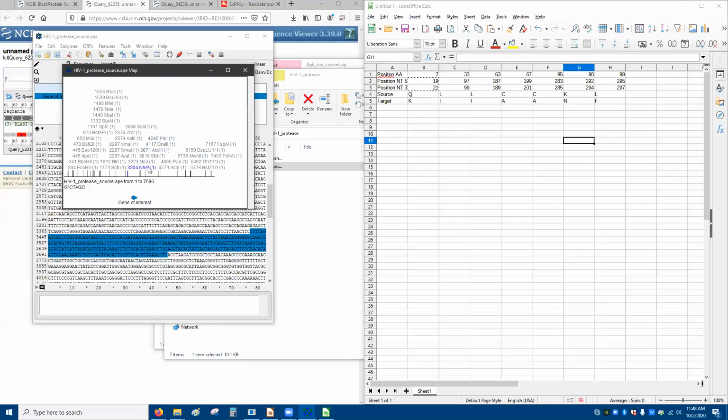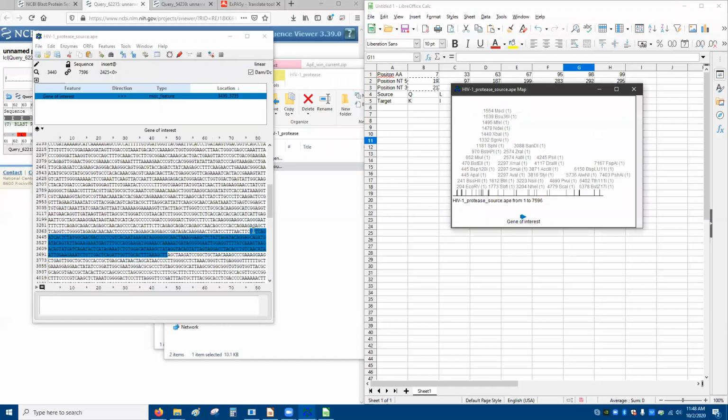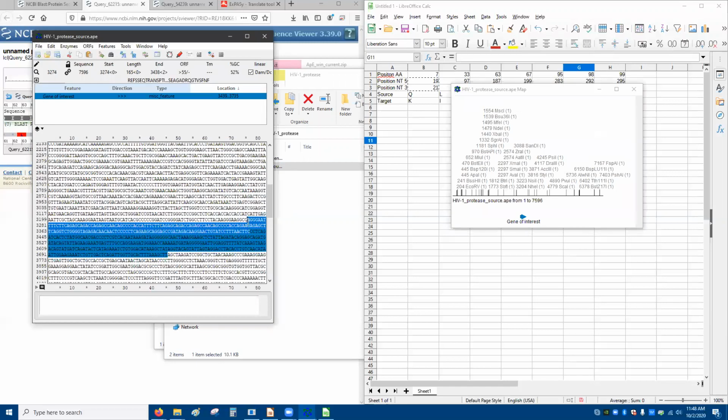So we want 319. Just like this. We'll do 319 to 34 something. So this is a possibility.